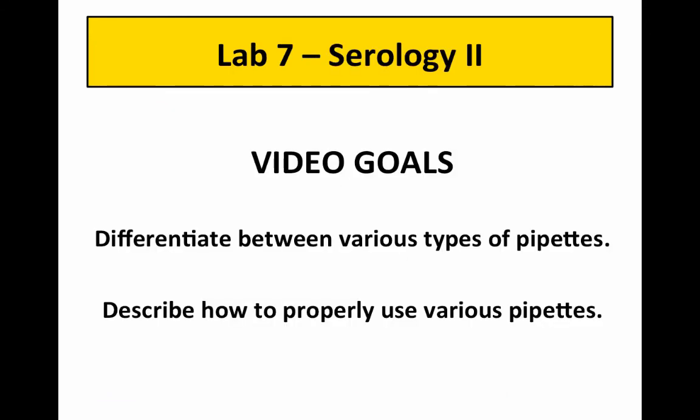So the goal of the video was to help show you some of the different types of pipettes we use in the lab and give you a little bit of information on how to use them. In lab, you're going to get that experience and you can ask questions then. Thanks.